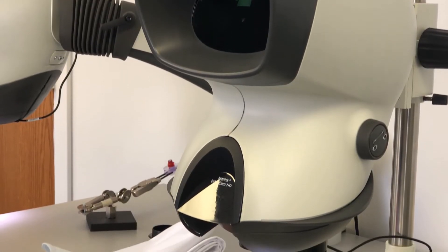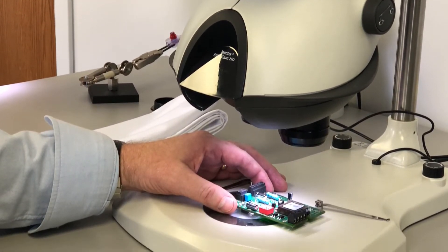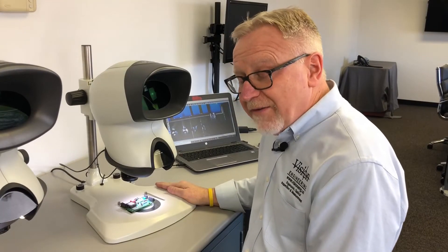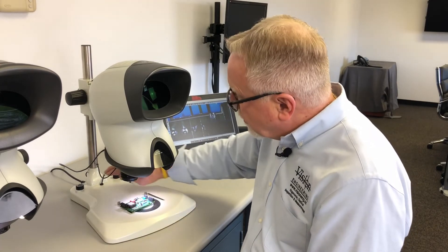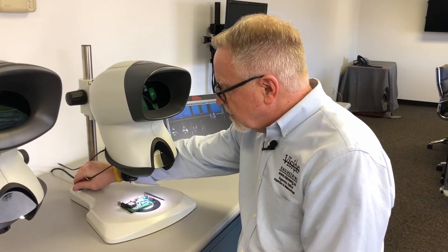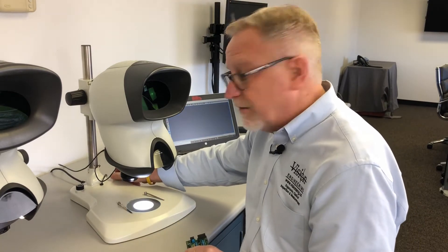Here the Elite is sitting on our bench stand. It's also available on the same stand that the Mantis Compact was on. On the bench stand as we have it configured now, this stand gives you the ability to have both transmitted and reflected light. So I have rheostat control over my surface illumination and a separate control for transmitted light — my substage illumination. This is the only stand we offer that option on for people that need that kind of illumination.